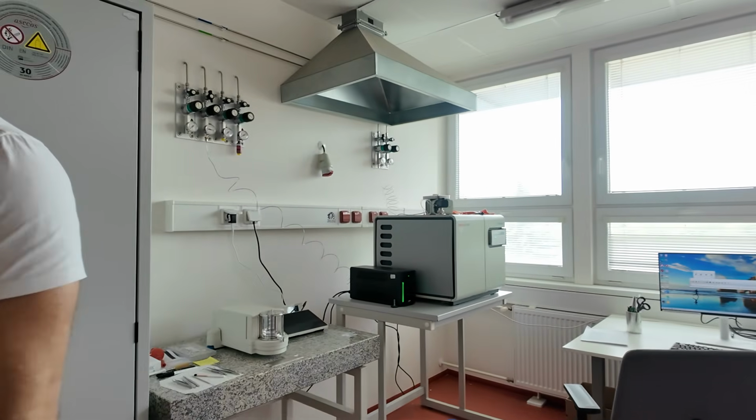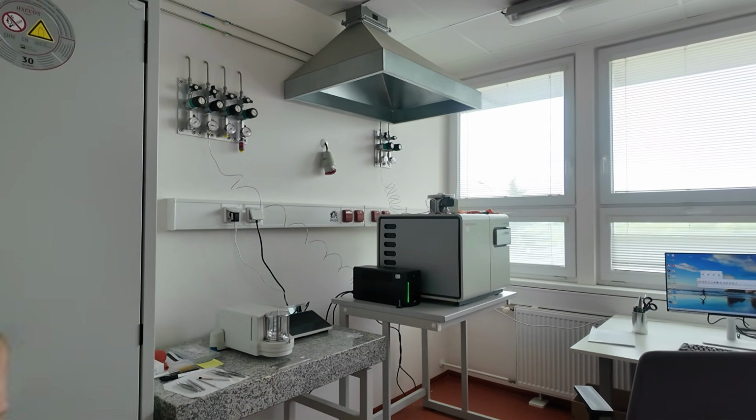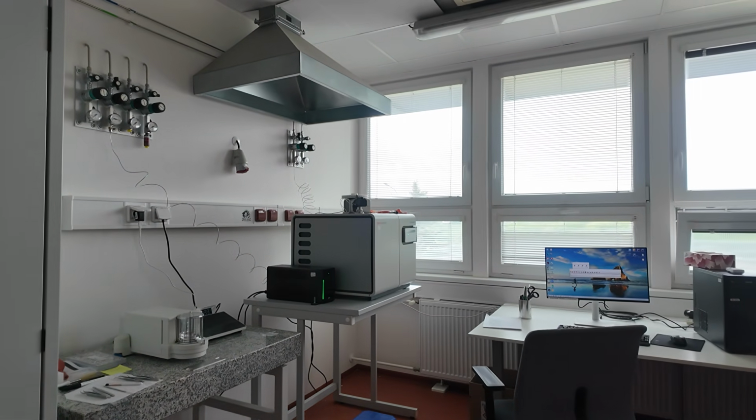You can do old and very out-of-date methods, but for example, if you have a whey protein or some sort of protein, this is also the machine you use to calculate the actual protein content. We've tested some whey protein samples to see whether they fit the description, and it works extremely well.